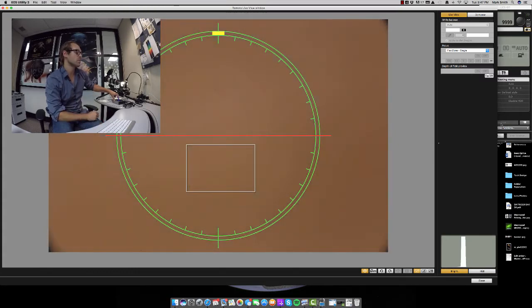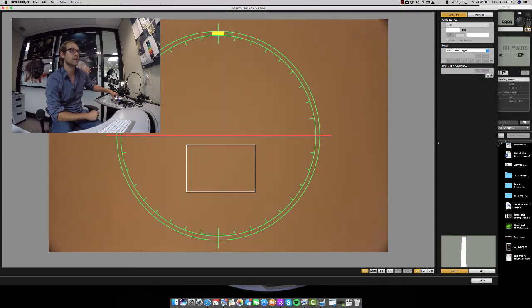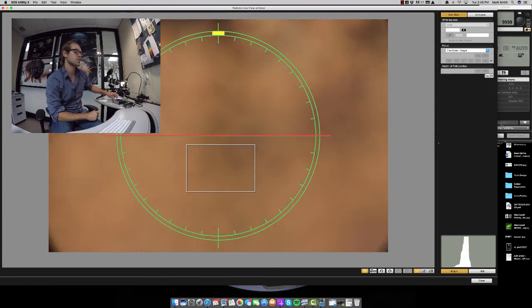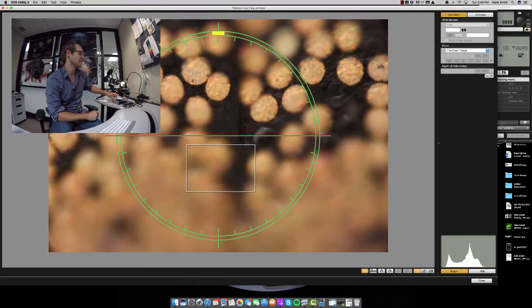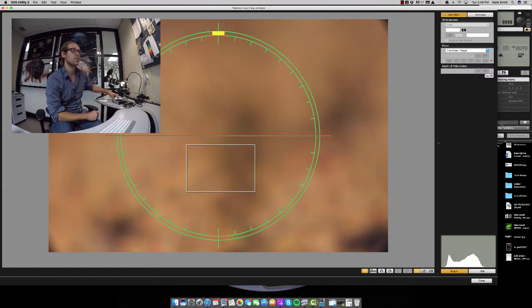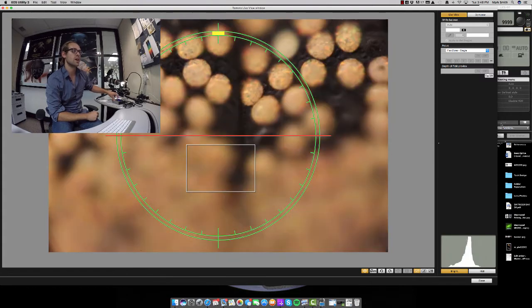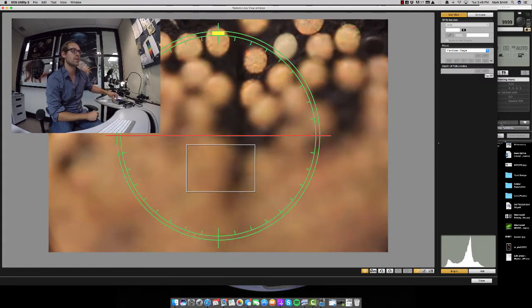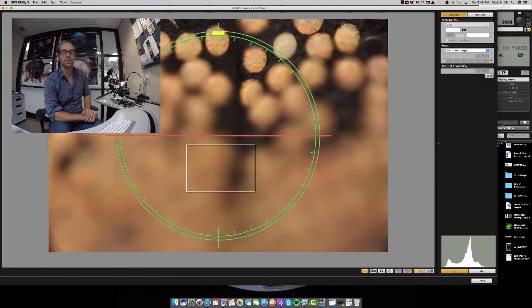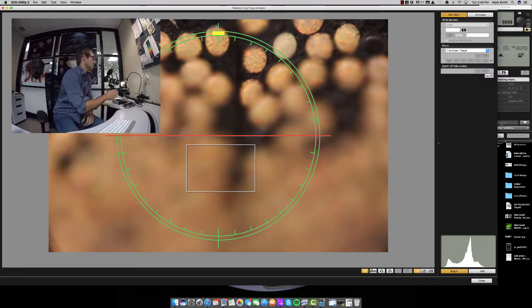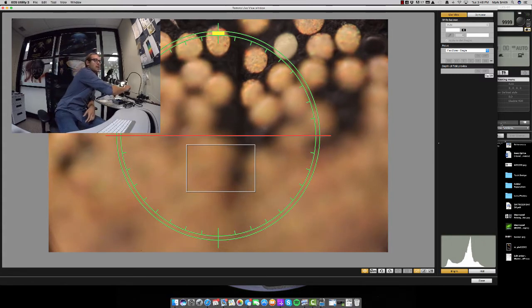We're finally finding the area of this. Basically, we're bringing the subject into the focal plane. We're almost there. Oh, just went through it. So you can really see how short and narrow the focal plane is. But you can see how close we are to this subject, which is pretty phenomenal.